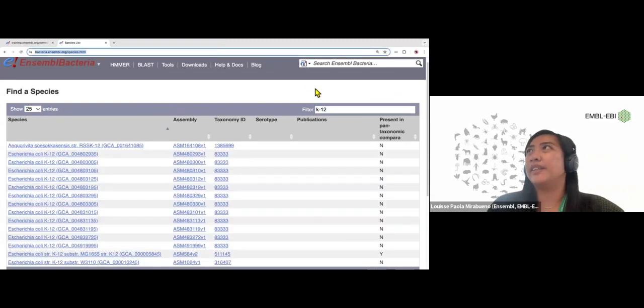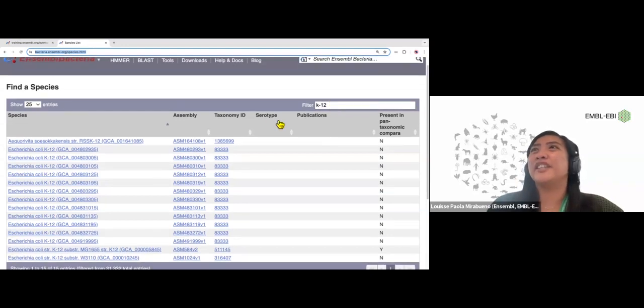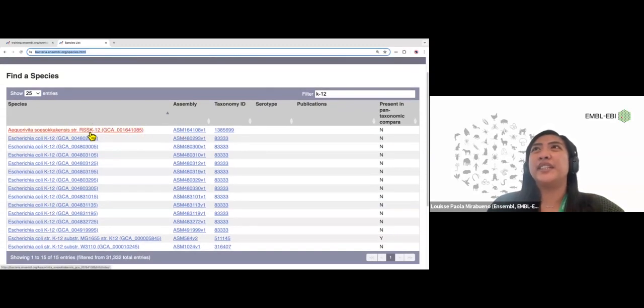Sorry, guys, I think my website is loading a bit slowly, so it took a bit of time to update that. So if you just type in the strain ID, actually, it makes it a bit easier for you. So I've just typed in K12, and you can see here in my list, we've got all of the available bacterial genomes that have K12 in their name. So most of them are E. coli here. And the one I was actually interested in was the substrain MG1655.